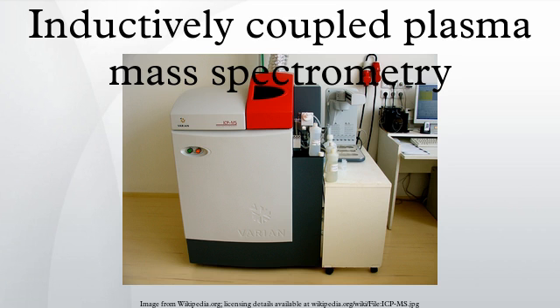The accelerated electrons collide with argon atoms, and sometimes a collision causes an argon atom to part with one of its electrons. The released electron is in turn accelerated by the rapidly changing magnetic field. The process continues until the rate of release of new electrons in collisions is balanced by the rate of recombination of electrons with argon ions. This produces a fireball that consists mostly of argon atoms with a rather small fraction of free electrons and argon ions. Advantage of argon: making the plasma from argon, instead of other gases, has several advantages.